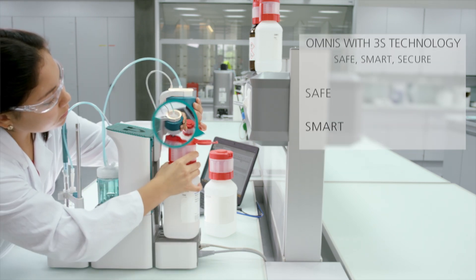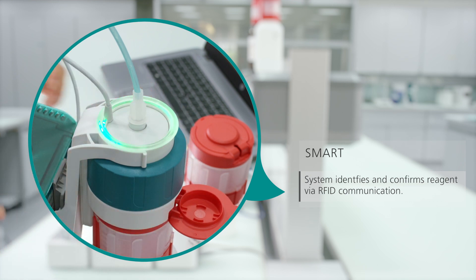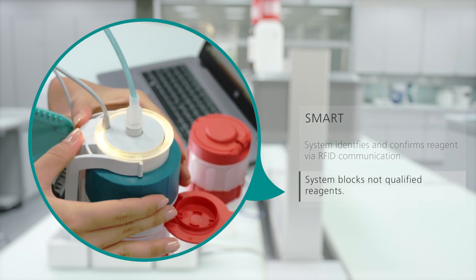3S technology is smart. Reagents for Omnis come with an RFID chip in the bottle cap. Omnis reads this chip to identify and confirm the reagent. Reagents that do not qualify will be blocked.